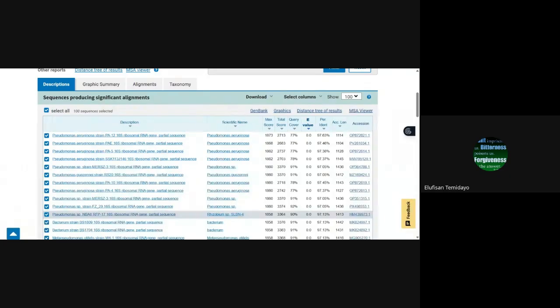So the first thing I want to do is, from what our teacher has told us, the e-value is very, very important, and it shows us that the e-value is 0.0. So they are reliable sequences I can trust because of the e-value first. I can trust that these organisms are related. Then the next thing is the query cover. The query cover shows us that there's a lot of discrepancy, and many nucleotides are not the same.